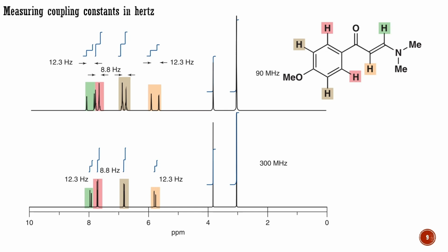Couplings may be marked on the spectrum, electronically, but if not, then to measure the coupling, measure the distance between the lines by ruler or dividers and use the horizontal scale to find out the separation in ppm. The conversion is then easy. To turn parts per million into Hertz, you just leave out the million. So 1 ppm on a 300 MHz machine is 300 Hz. When you change from one machine to another, say, from a 200 MHz to a 500 MHz NMR machine, chemical shifts stay the same in ppm and coupling constants stay the same in Hertz.